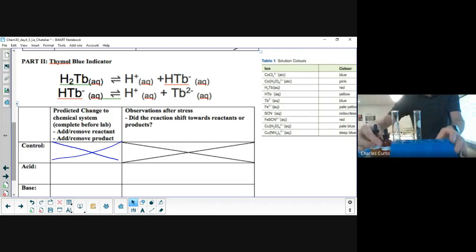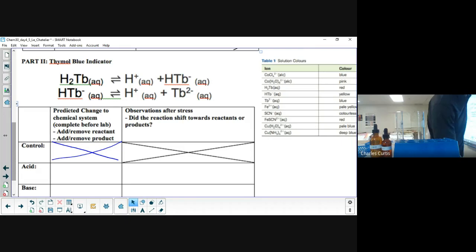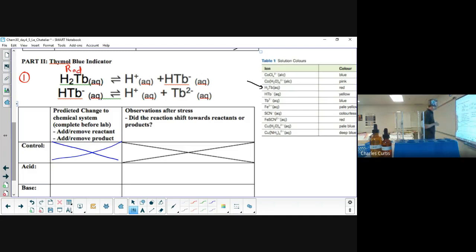So let's predict the shifts before we add in our acid and our base. Sorry, do the colors, then predict the shift. So H2TB is right there. If we have all reactants in reaction number 1, we would see a red color. If that top reaction 1 shifts to products, we have 1 H, and that is going to be yellow. Now our second reaction starts with that same species, so that's yellow. And if it loses its last H and goes to just TB2 minus, then we're going to see a blue color.